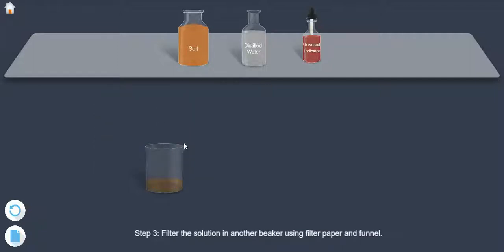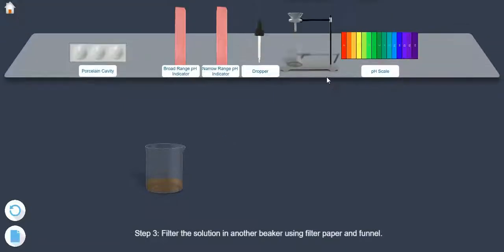Step 3: Filter the solution in another beaker using filter paper and funnel.